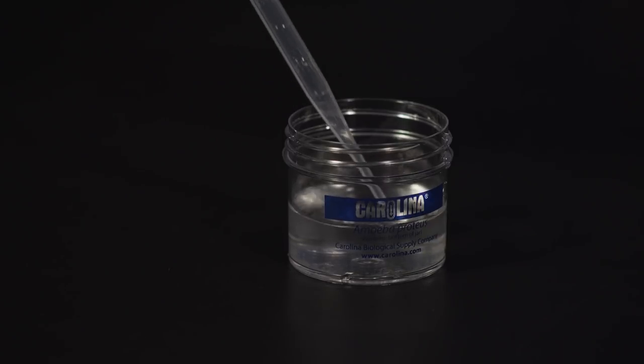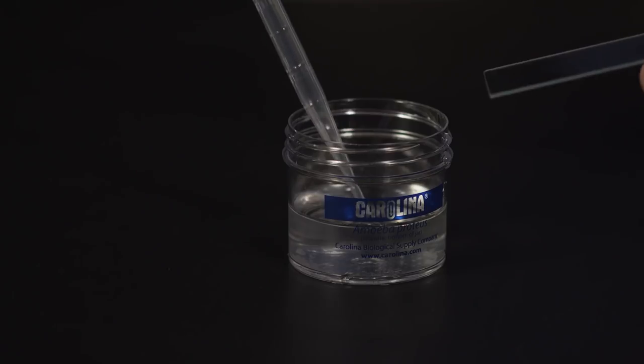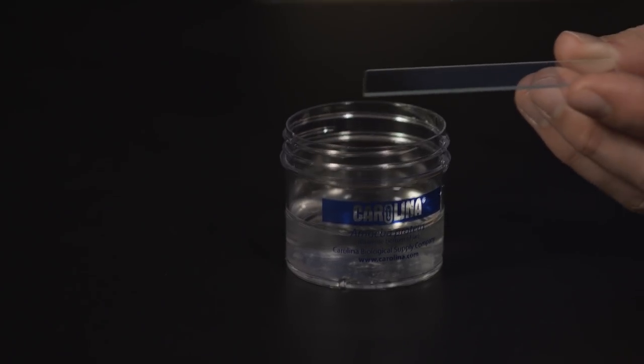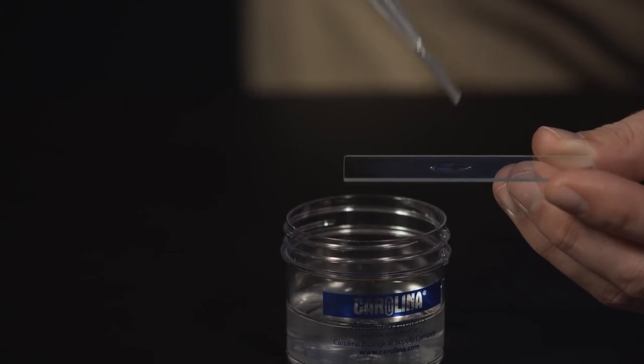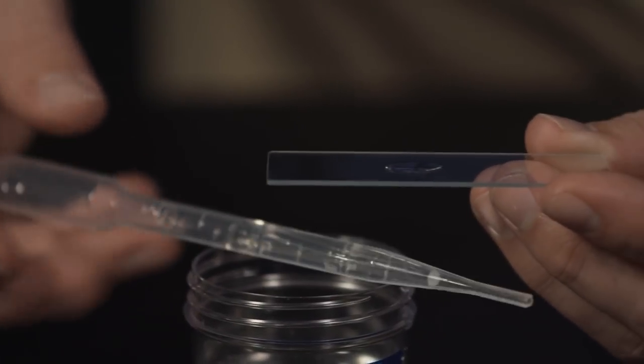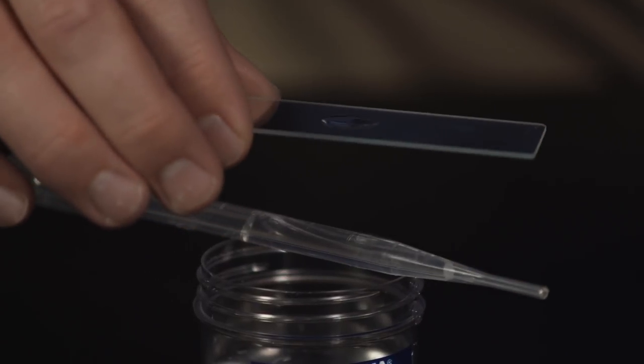Gently aerate the decanted culture jar to suspend the amoeba, creating a concentrated amoeba mixture. Remove the pipette from the jar and slowly expel a drop onto a clean slide. Gently place the cover slip onto the drop.